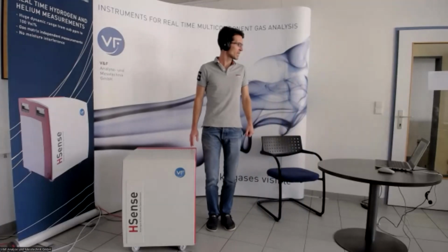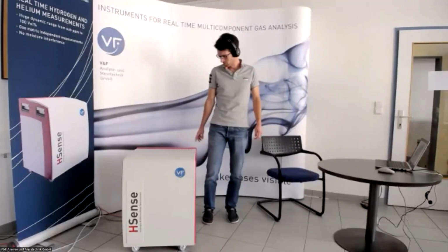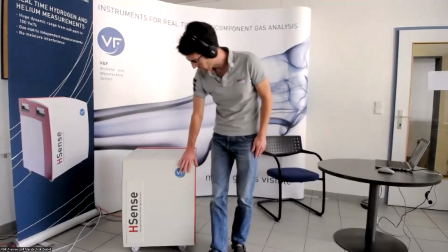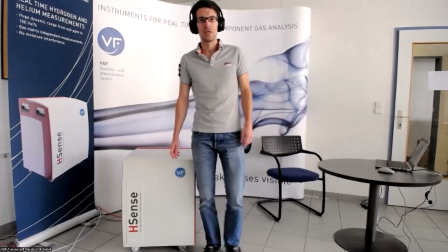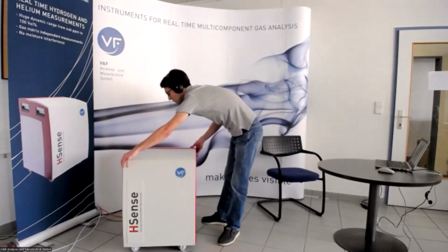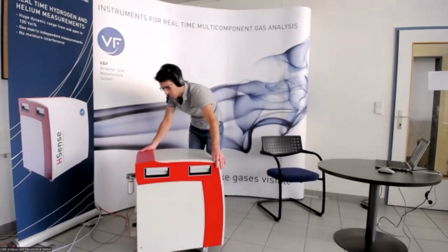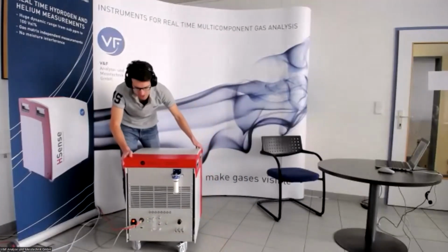Since I'm standing next to it, you can get an impression of its dimensions. It's a box of about 70 kilos coming in this red housing. This is the more uninteresting part, just the label. The interesting part for you will be when we rotate it around. Since we're using turbo pumps, when the instrument is running you need to move it very carefully, because there is a turbo pump rotating at 1500 hertz inside.